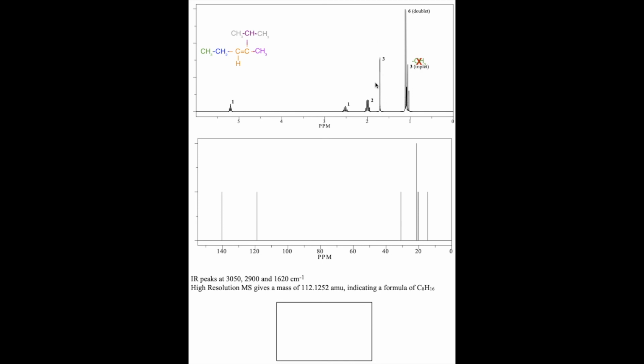And it's generic, right? Below 2. And then I have this sort of weird, what's commonly referred to as an isopropyl group. But if you look at it, I have this sort of purple-ish CH, also fairly generic in terms of where it should show up. It's not attached to a carbon with a pi bond or a bond to an electronegative atom. So a boring CH, and it has 6 identical neighbors, right? These 3 methyl groups here, those hydrogens are the same as these 3 hydrogens. And that means it has 6 total identical neighbors. So n is 6, n plus 1 is 7. I should have a generic CH septet. And I do, that thing right here. If you really blow that up, you can see that this peak at about 2.5 is a septet.